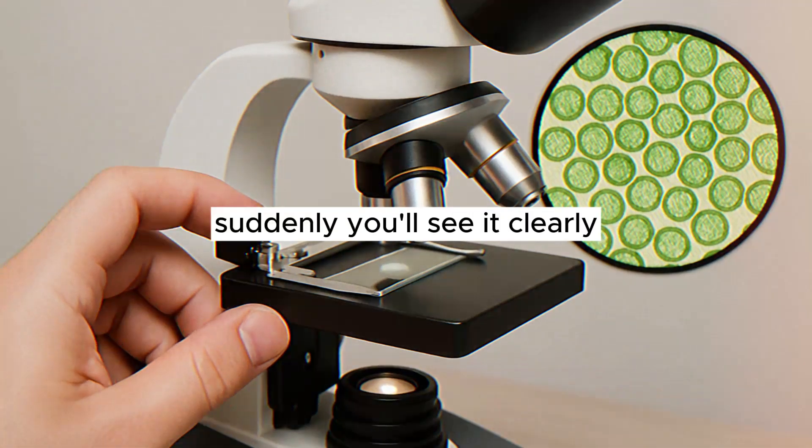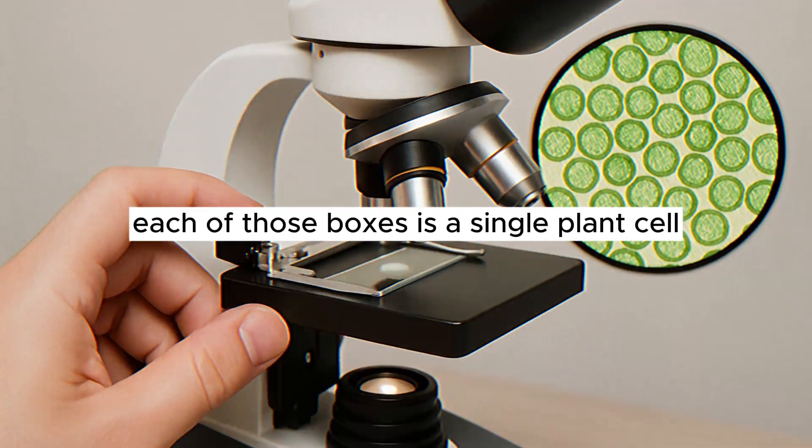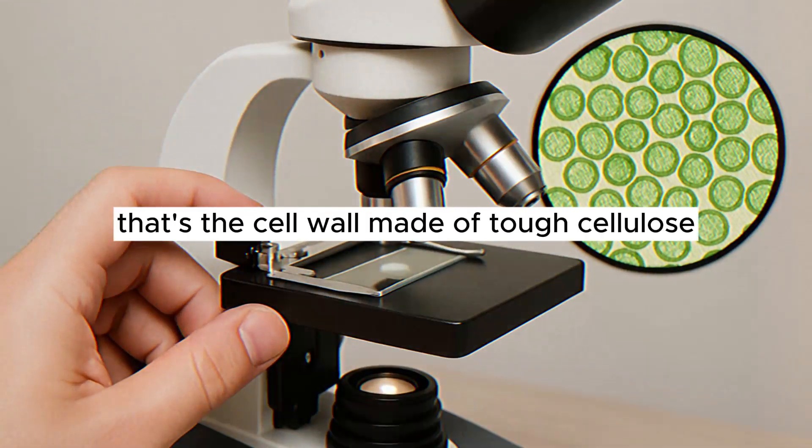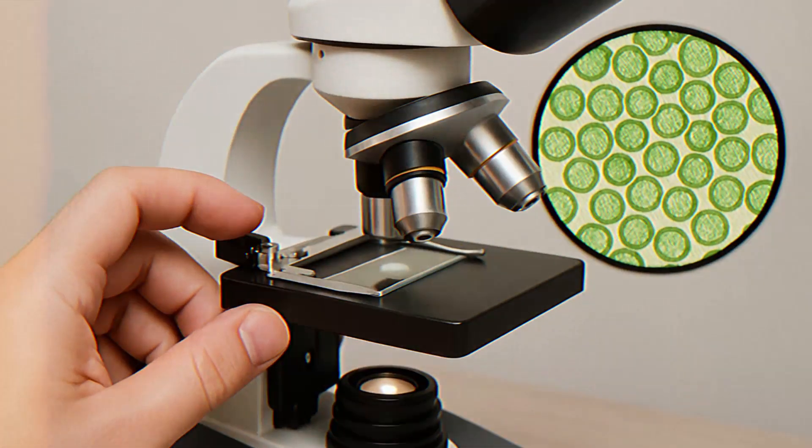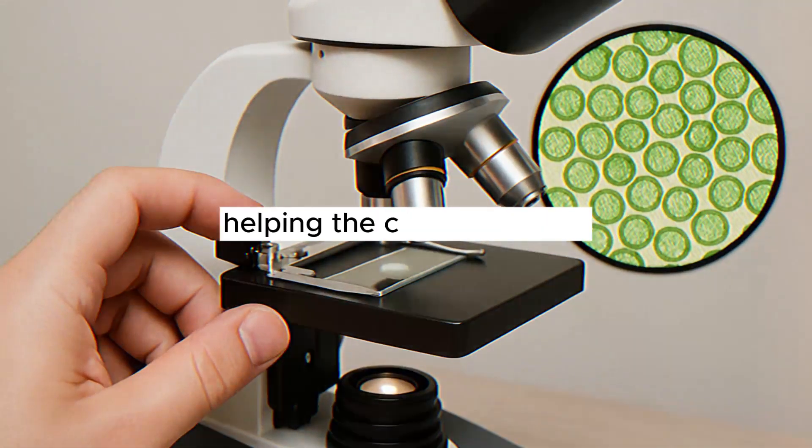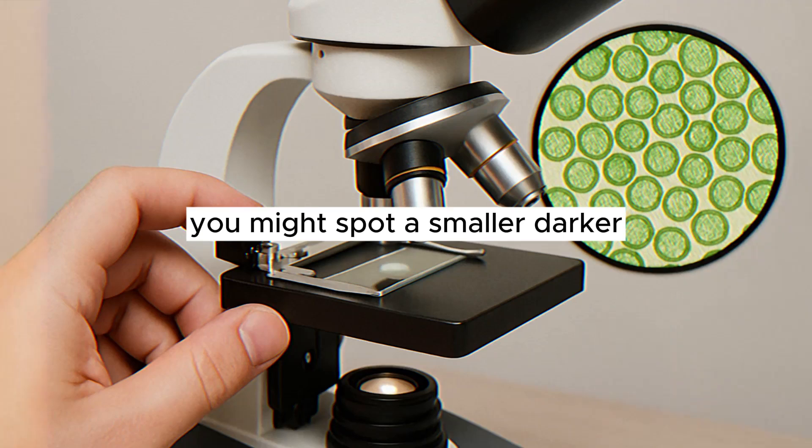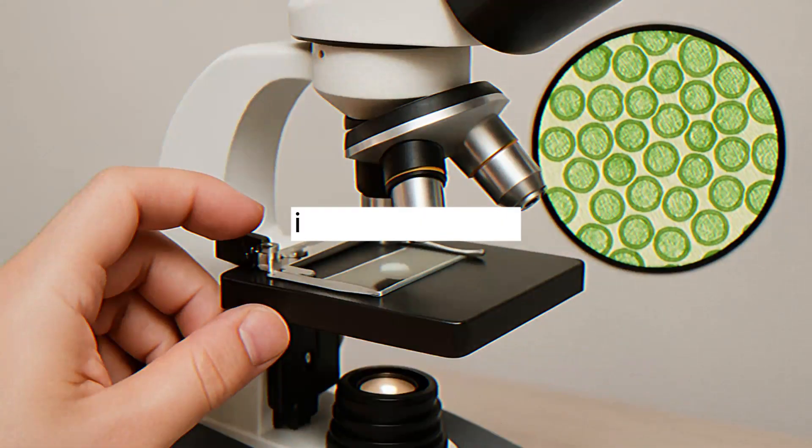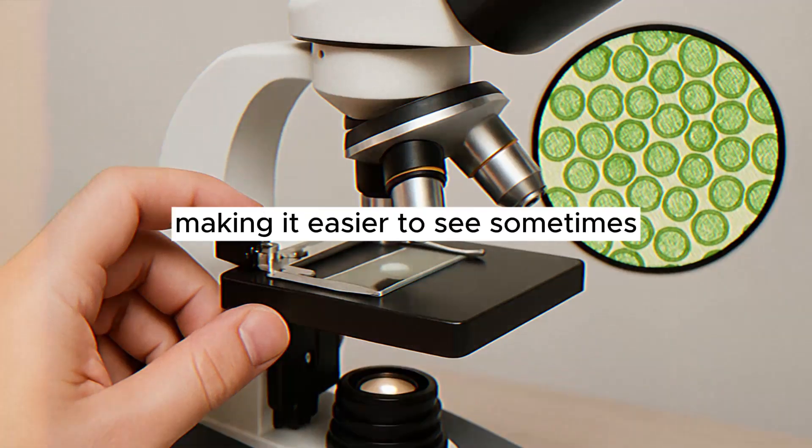Suddenly, you'll see it clearly: a neat arrangement of box-like structures. Each of those boxes is a single plant cell. You'll see a thick outer boundary. That's the cell wall, made of tough cellulose, giving the plant its structure and shape. Inside, you might see a large, clear space. That's the vacuole, a storage sack filled with water and other stuff, helping the cell stay plump. If you look carefully, often near the edges, you might spot a smaller, darker, roundish structure. That's the nucleus, the brain of the cell holding its DNA. If you use iodine, it might stain the nucleus a yellowish-brown, making it easier to see.